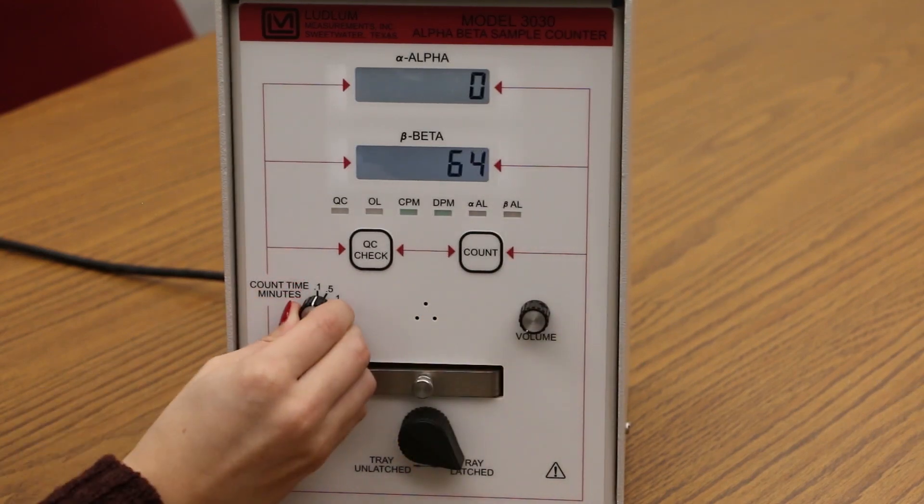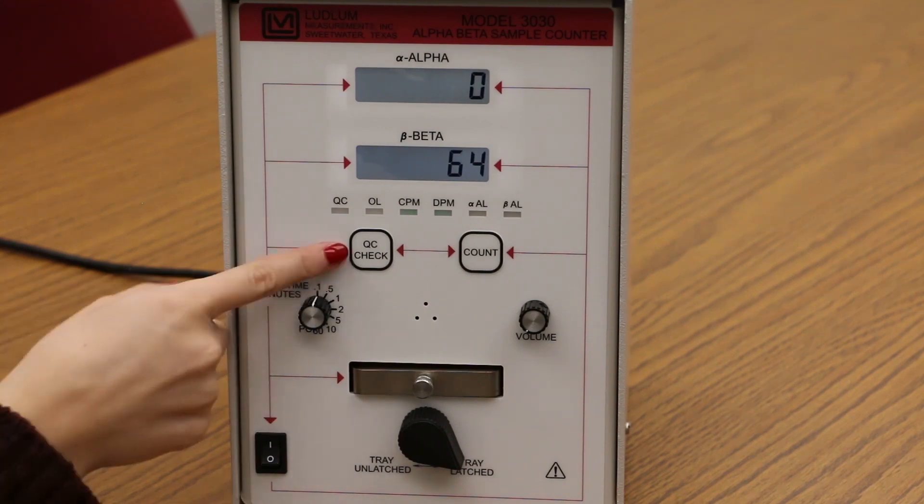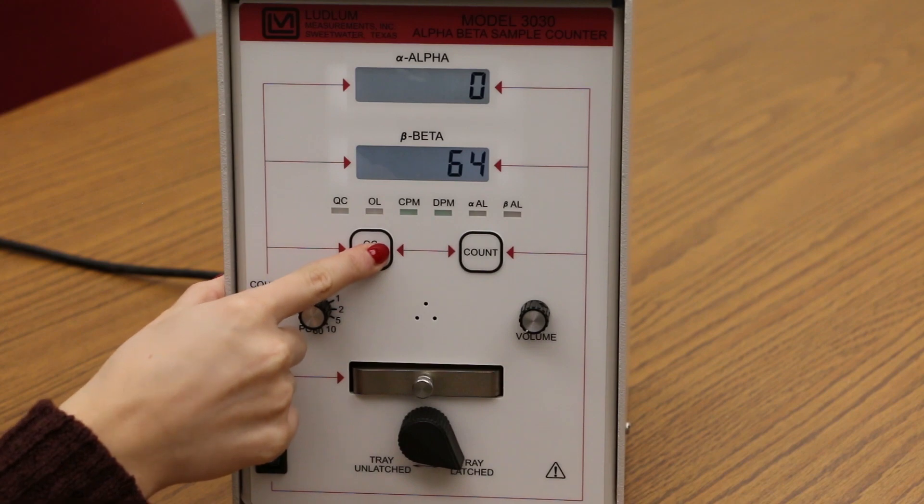Adjust the count time switch to your desired count time. The factory default operating mode is scalar count. In this mode the QC button is disabled.